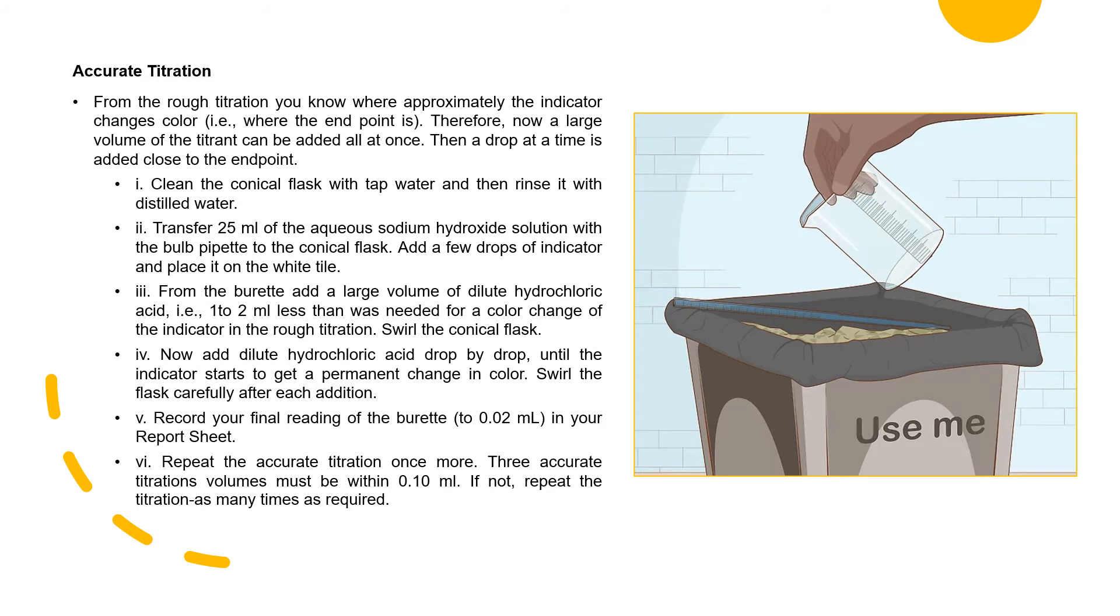Now add dilute hydrochloric acid drop by drop until the indicator starts to get a permanent change in color. Then again, you must swirl the flask. Record your final reading of burette in your report sheet. Repeat the accurate titration once more. Three accurate titration volumes must be within 0.10 ml. If not, repeat the titration as many times as required if the difference between accurate titrations are not within 0.10 ml.